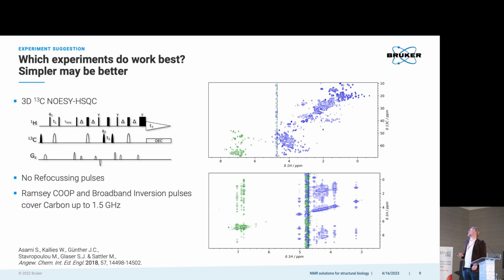So for example, looking at the spectrum, and if you haven't seen this before, trust me, this is about the most simple sequence that you could run that would provide you with this information. If you have dealt with spectra before, I hope you can appreciate the spectrum quality.